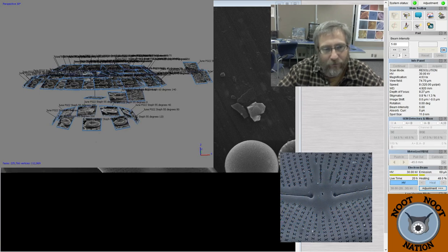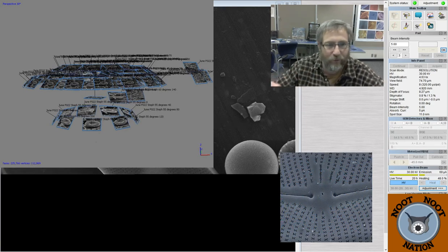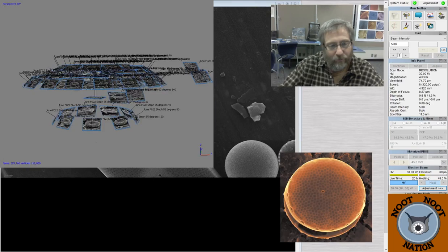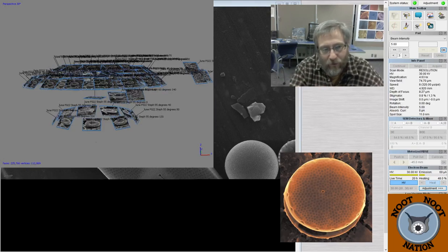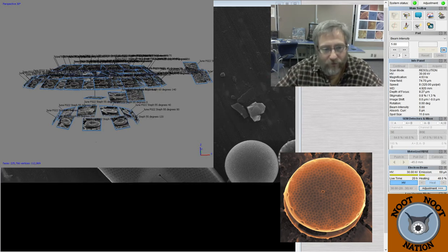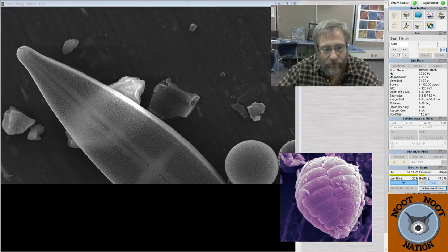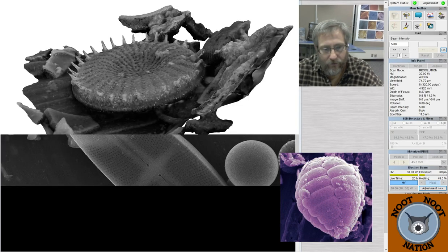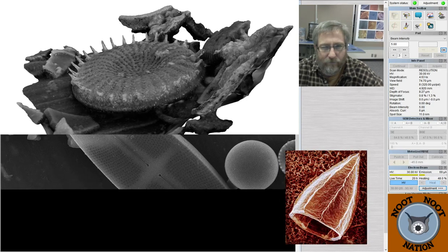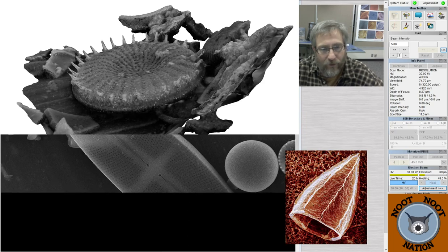And then here it is at a low angle. You can actually see it not only maps their image, but also where they would be in that landscape, right? And once it has all of them there, then it starts to build a mesh of the three-dimensional object from all those different pictures, and it puts all of the pictures together and basically calculates what that surface looks like. And this program is called, what's the name of that program? Agisoft.